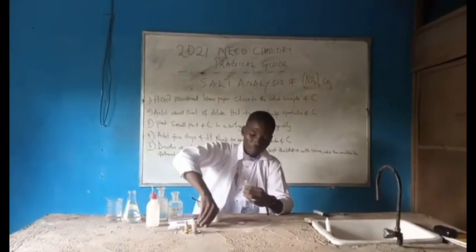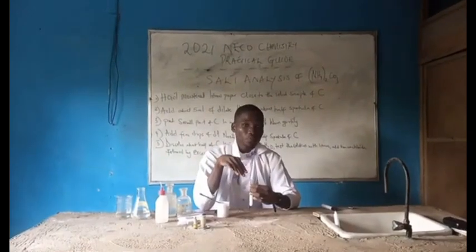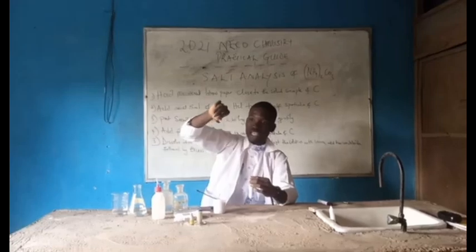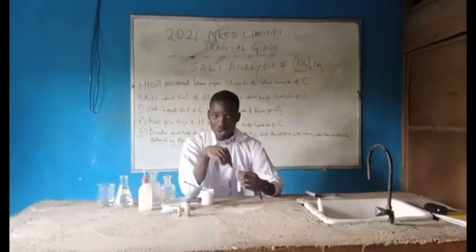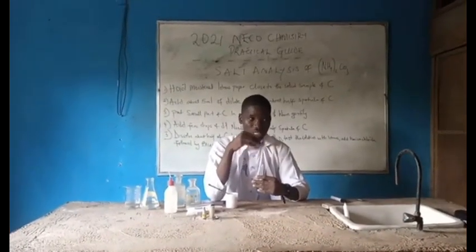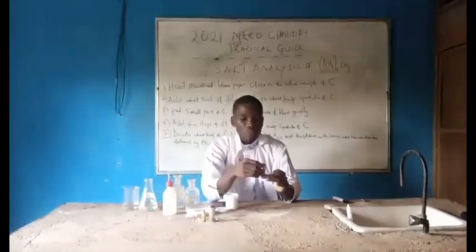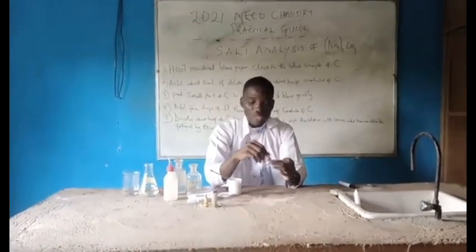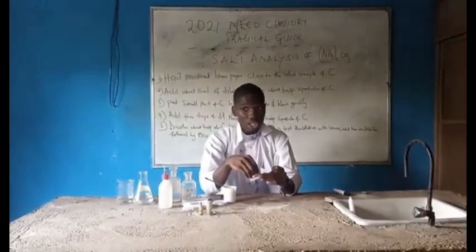Irritating smell. And again now, as I told you earlier, when we are using this baking powder in place of ammonium carbonate, it takes time before the red litmus paper turns blue. As you can see, it has turned to what? Blue. Yes or no? Are you with me now? So with what I perceive, can you get me now? I perceive what? A choking or irritating smell. So now, if I decided to pick up a litmus paper, or if I want to test my sample C with dilute sodium hydroxide, what will I observe? There is a choking smell.